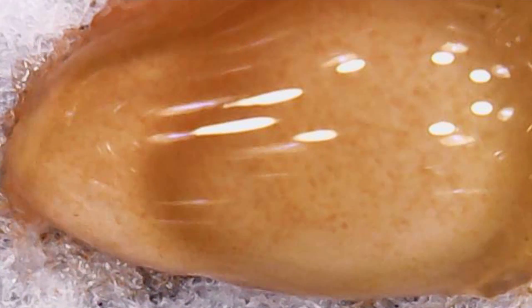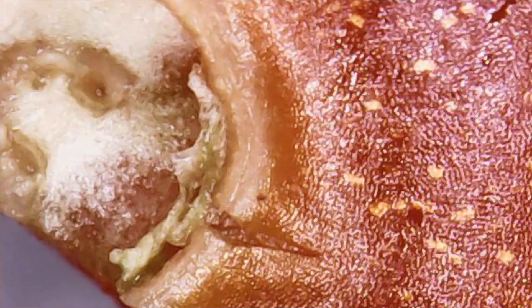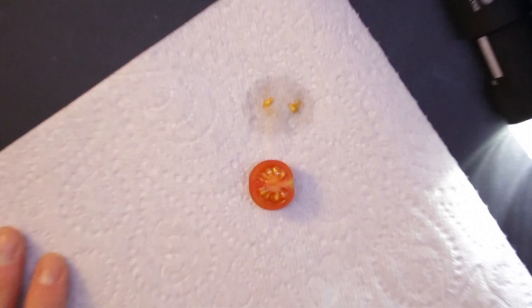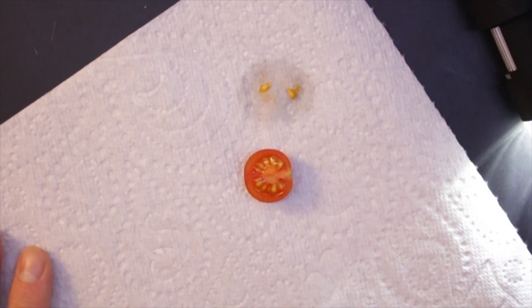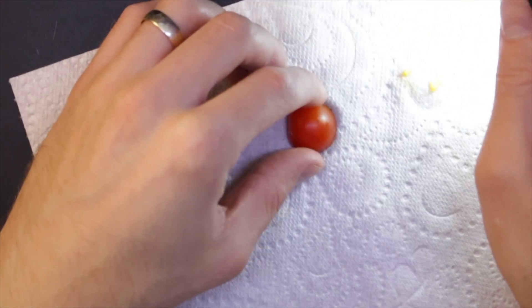There's the seed there. Tiny. In the middle. Flesh here again. Here's the seed that's fell out of it. Absolutely gruesome under the microscope. And it's covered in the juice. Black dots on it as well. Bit lumpy at the top. There's the bit where the stem comes out. Bit furry in there. Skin. Red as you like. Actually it's quite rough. Very skinny. Little tomato. So that's that.